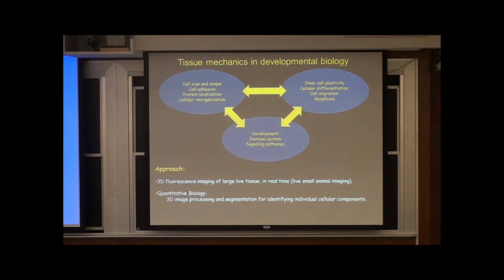Then we can get quantitative information by image processing, segmentation, and tracking individual cells, and ultimately you can get fundamental ideas about the mechanism of development and tissue mechanics.